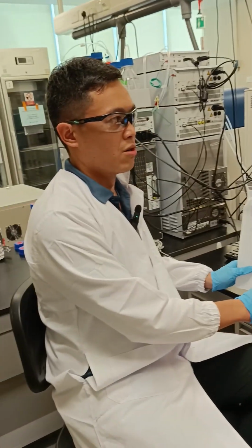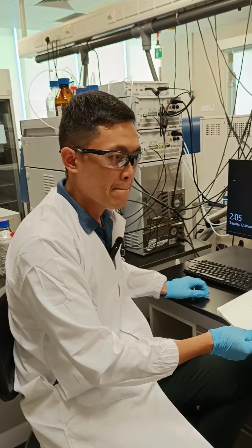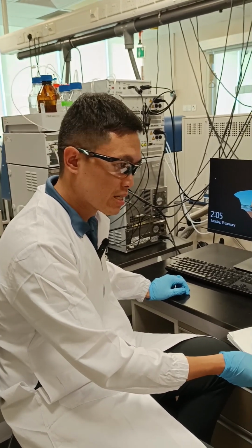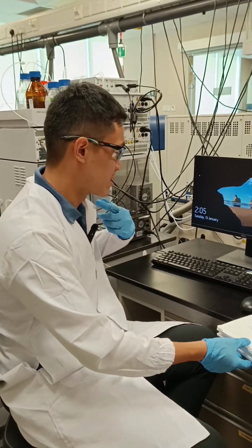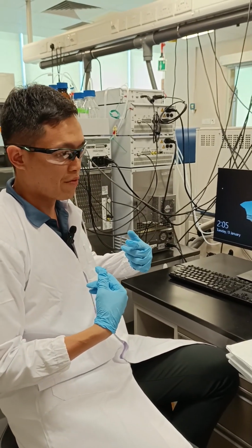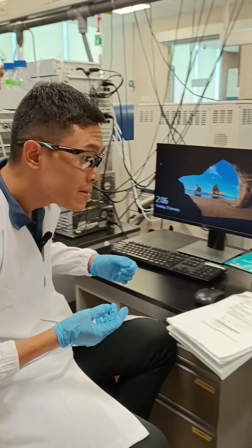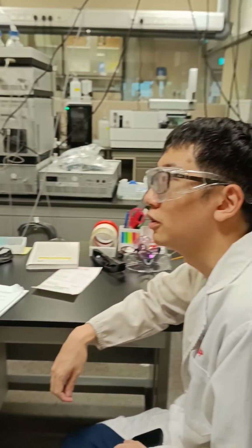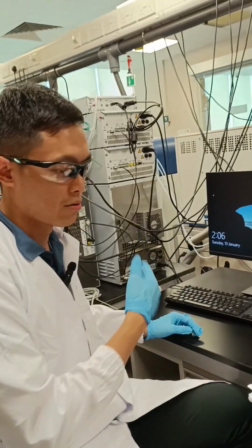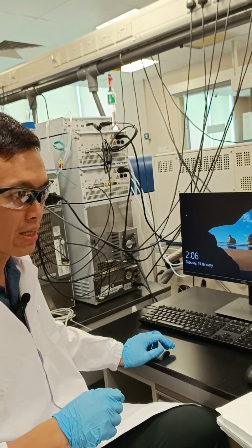Before that, I would like to know what samples you are going to run to analyze. Organic drug. Okay. But in which object? Like, what's the target? For example, from my background, we are dealing with plants, leafy crops. You mean the sample matrix? Yeah, the sample matrix, right? Water. Okay, sure. Because my background is dealing with these leafy crops, and we are trying to identify the metabolites in general.